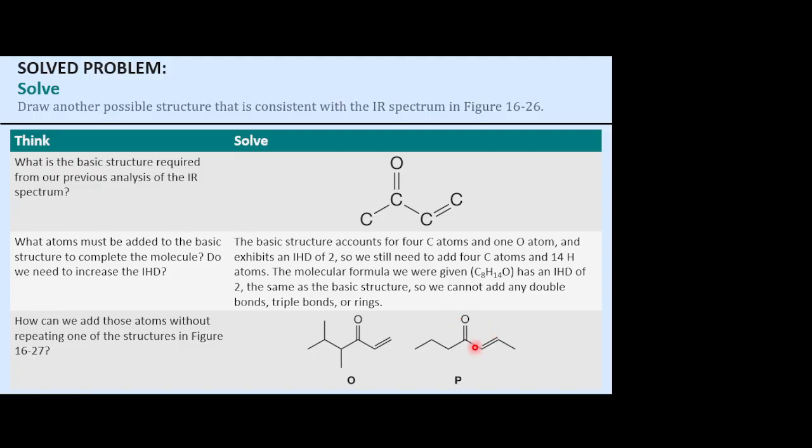So this obviously is an option as well. We could have placed this over here. Notice it still has hydrogens right there and there. And so we would still get our alkene CH stretches, wouldn't we? Note that if you put it on the other side, that's just the same symmetry, isn't it? Okay, so that's just that flipped.